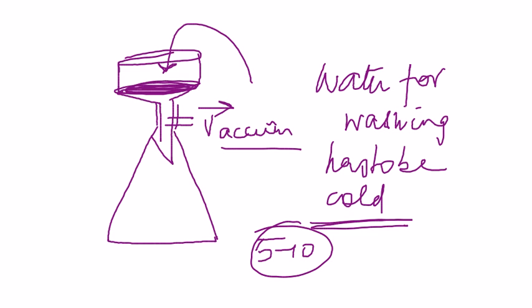Your yield will be calculated as a crude aspirin yield, considering that this wet cake that you're going to get on top of your filter paper will be pretty cakey. It will not be the usual solid that you get, which is shiny, but rather very cakey because this is crude. You will assume that 50% of that is water and only 50% of that solid is your product.